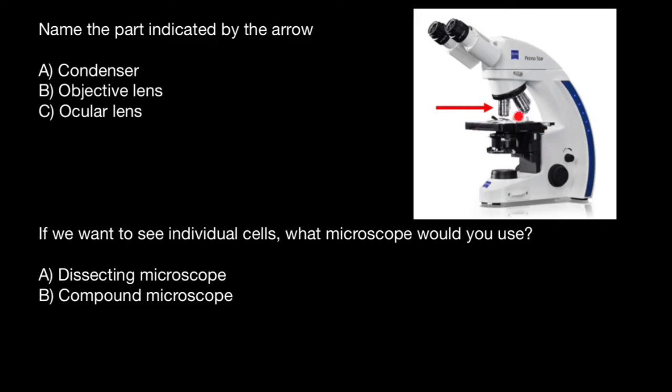Condenser would be this part of the microscope. Ocular lenses would be this part of the microscope. And this part of the microscope we call objective lenses.